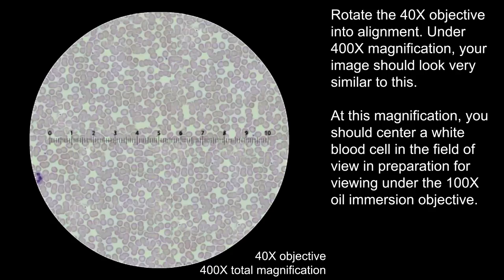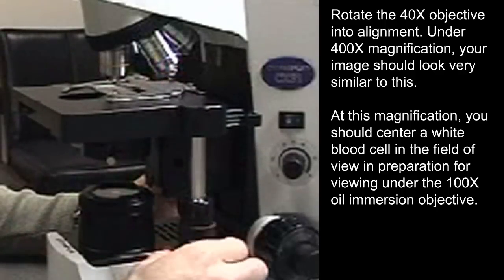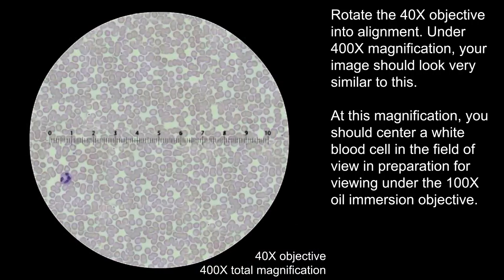Rotate the 40x objective into alignment. Under 400x magnification, your image will look very similar to this. At this magnification, you should center a white blood cell in the field of view in preparation for viewing under the 100x oil immersion objective.